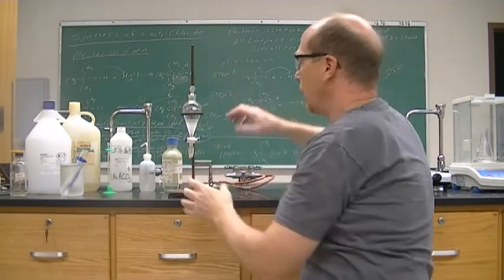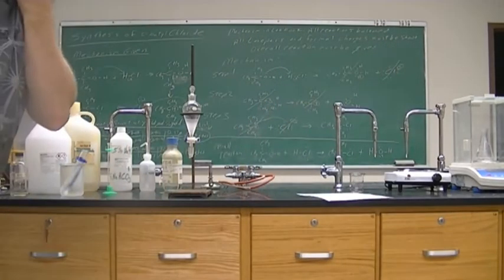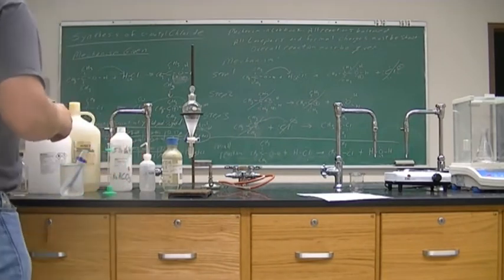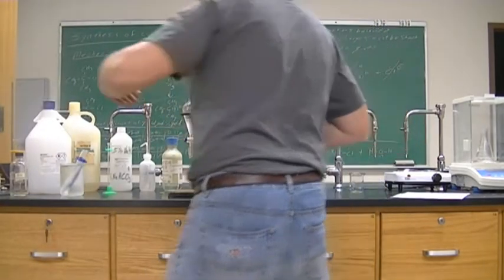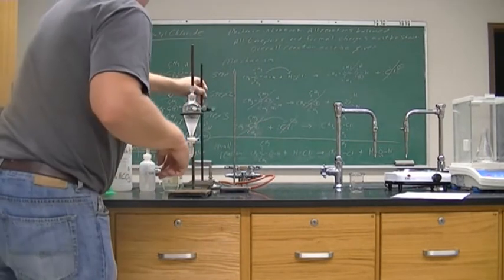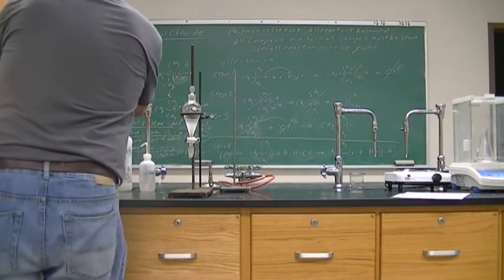All right, so while this is separating, it takes a while to separate, I'm going to set up a distillation. So we're getting a liquid here, and so we're going to have to purify it by doing a distillation. And so you can watch the setup of a distillation. And you can say, I'm glad I'm not doing that, I'm just watching that. Okay. All right.